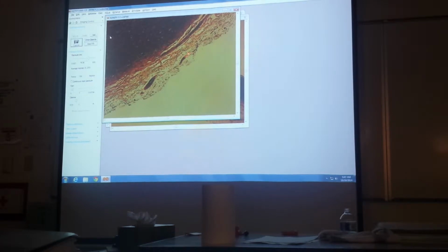So those little blood vessels there are considered vasa vasorum, the vessels in the tunica adventitia.